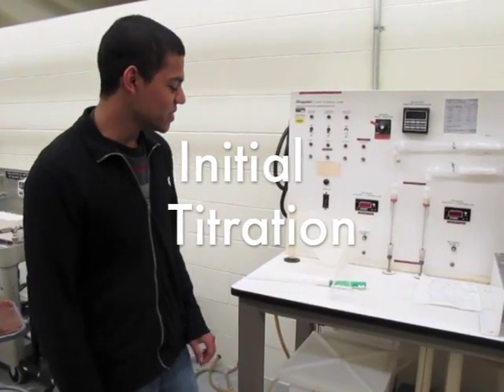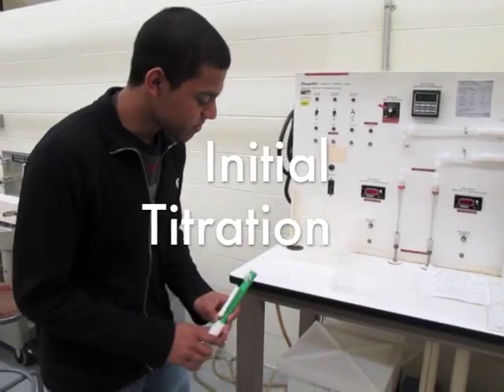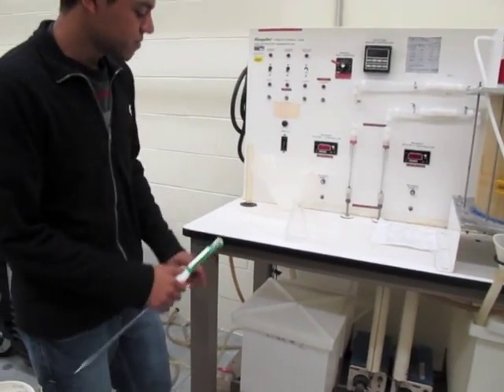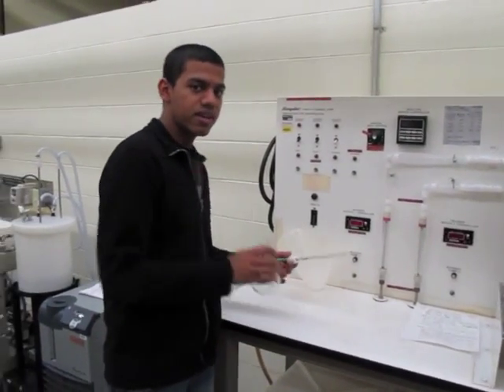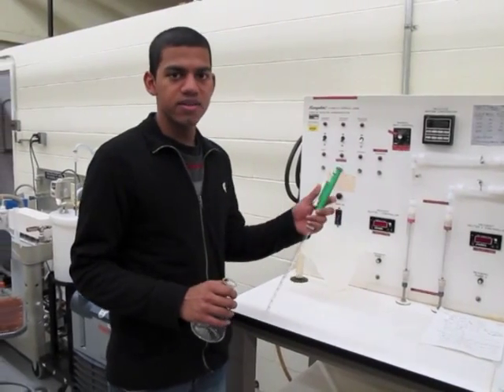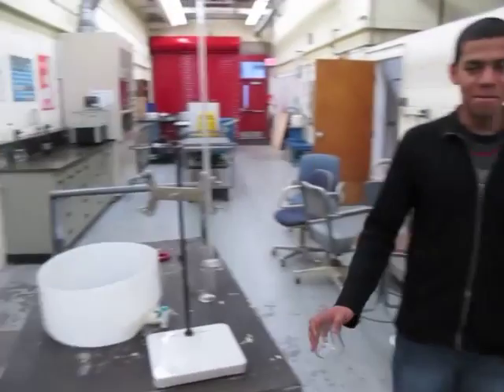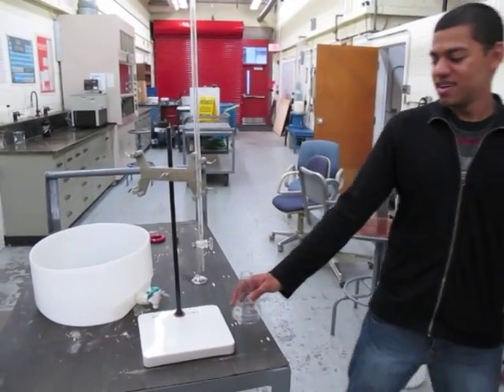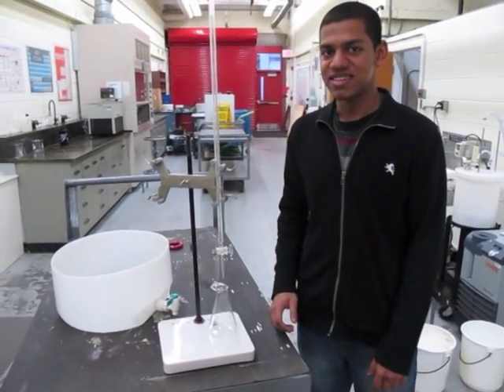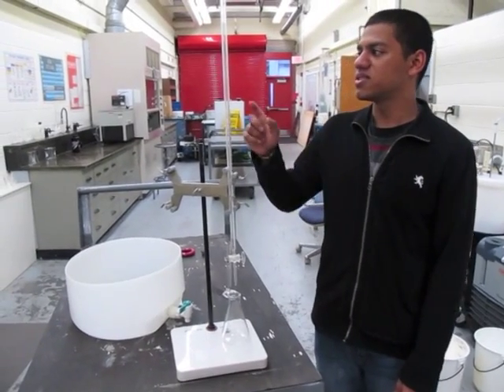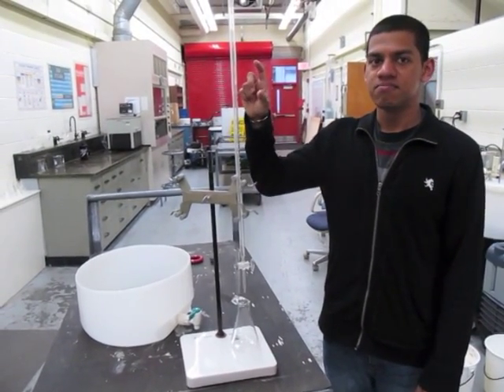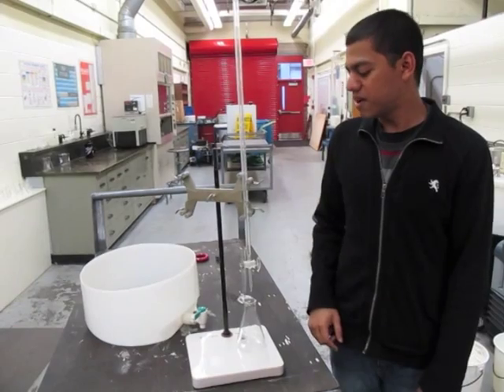For the initial titration, you want to take five milliliter samples from each of the tanks. First add NaOH to the HCl, and then followed by the isopropyl acetate. Then you want to add the indicator and titrate, recording the initial value and the value after titration.